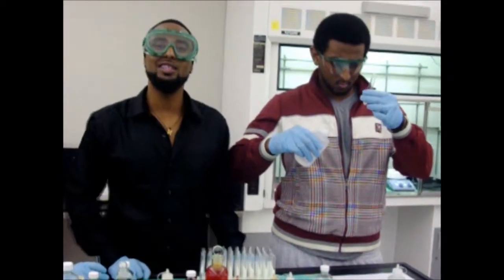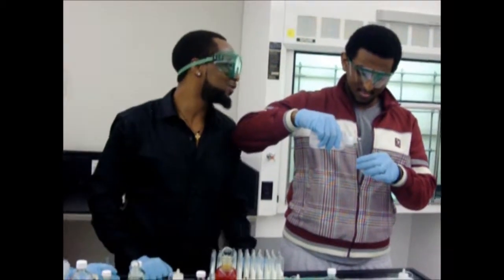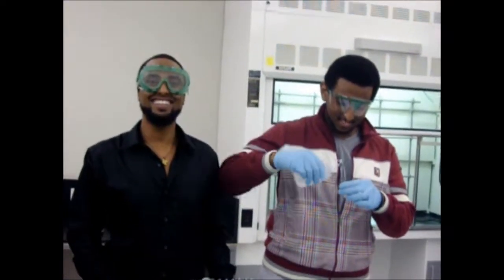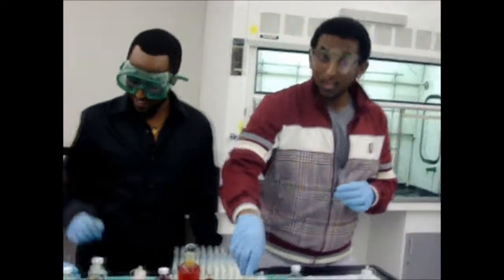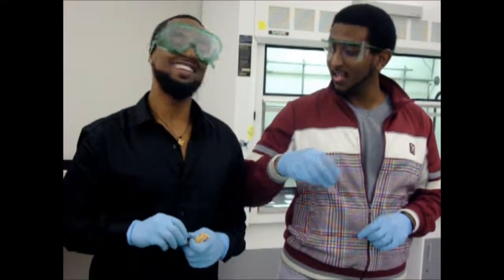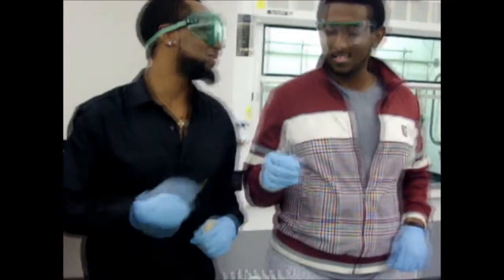Now we want it to completely dissolve, so we actually want more liquid in there than solid. So if you could please drop some more, sir. No problem. Thanks. I had to add a little bit more. So now, is it completely dissolved? Now we're ready to test with our pH litmus paper. Please test this for me, sir.